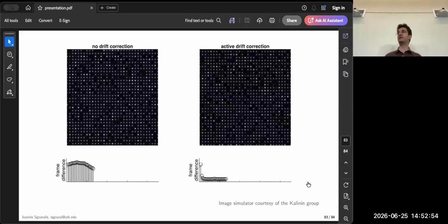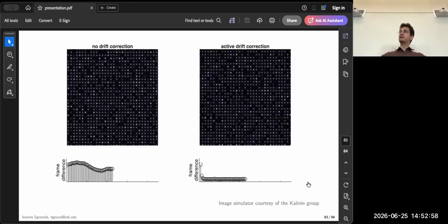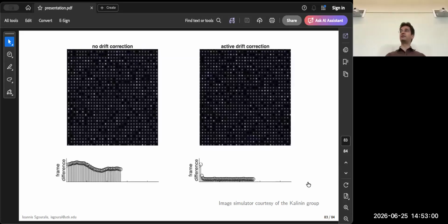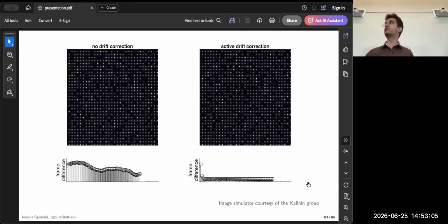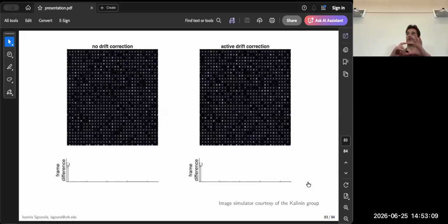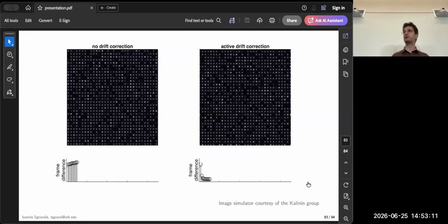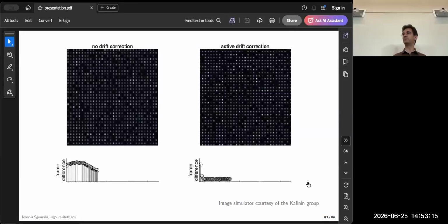And second, that edge effects are minimal, which means that our images actually need to be relatively large. Now, if you want to come up with your own experiment or your own microscope that fundamentally is giving very noisy images or very small fields of view, then most likely the methods that I described today need to be adapted heavily.